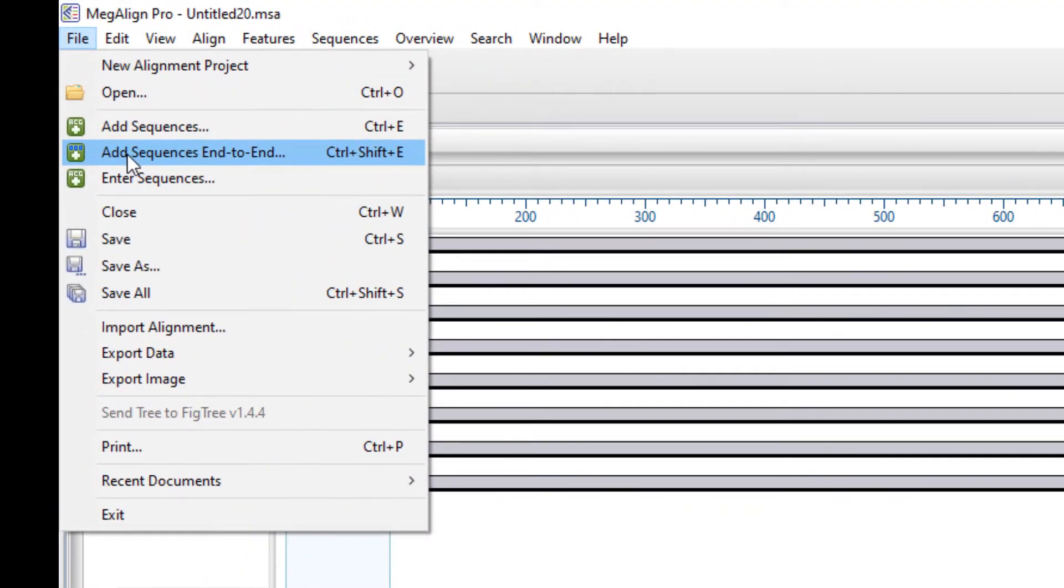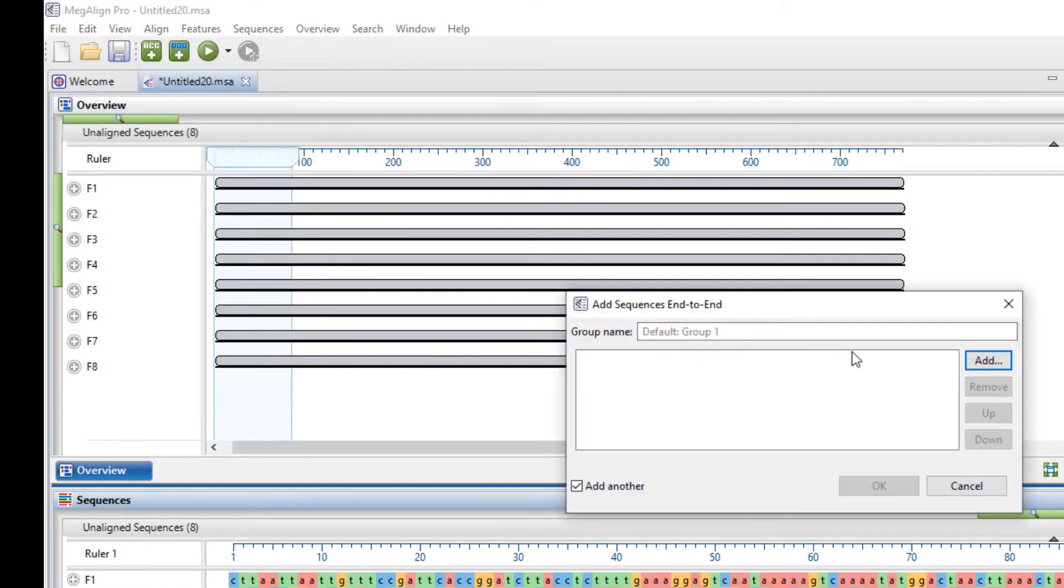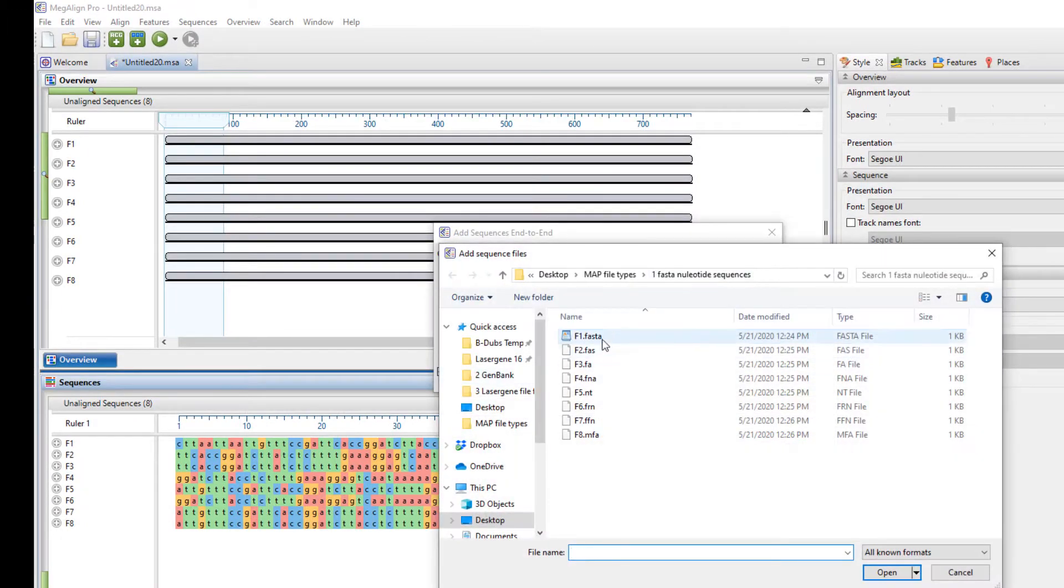There's also a couple more options. This one is add sequences end to end. This is effectively a concatenation of sequences. And with this one, I'm just going to leave the default name, but I'm going to add my sequences. Here I'm going to choose my first two.